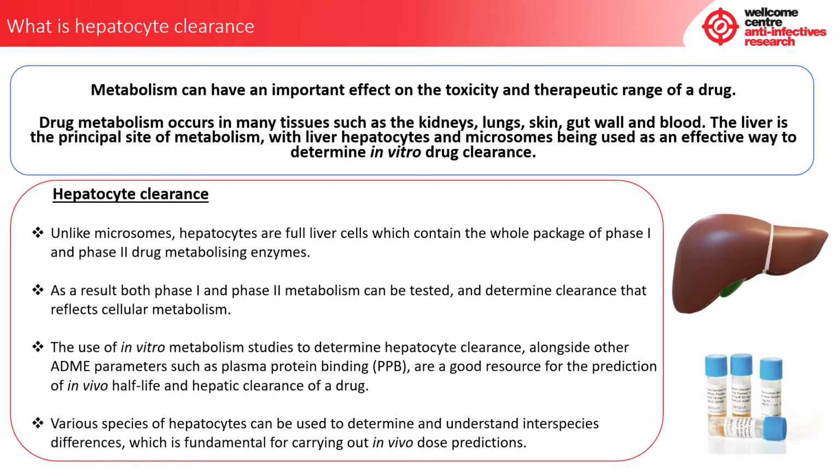Various species of hepatocytes can be used to determine and understand interspecies differences, which is fundamental for carrying out in vivo dose predictions.